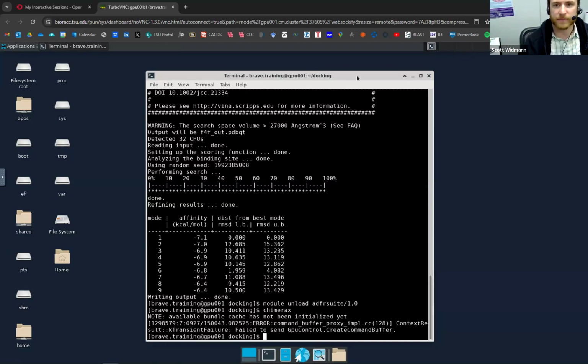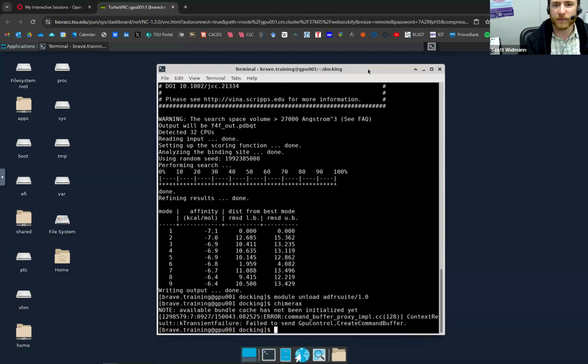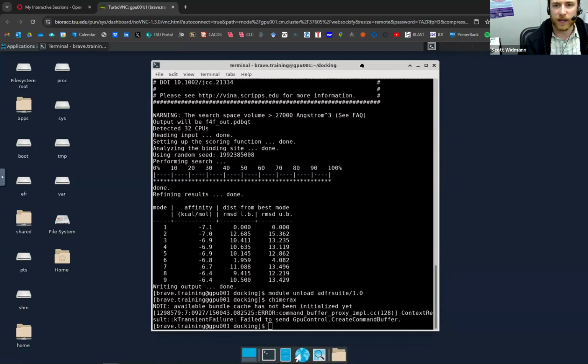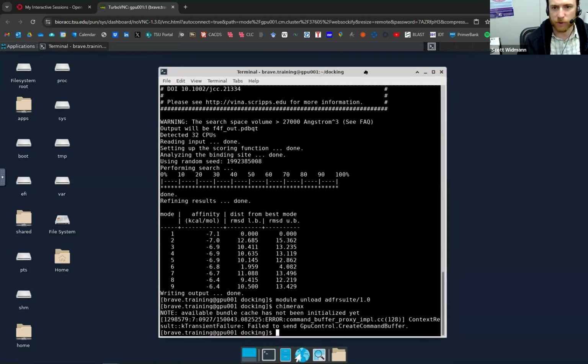And so once you've done that, let me know if you're having trouble. Please reach out and I can help you troubleshoot. And feel free to dock your own proteins. Maybe you want to look at COVID, maybe some COVID inhibitors or something, a protein from the virus.